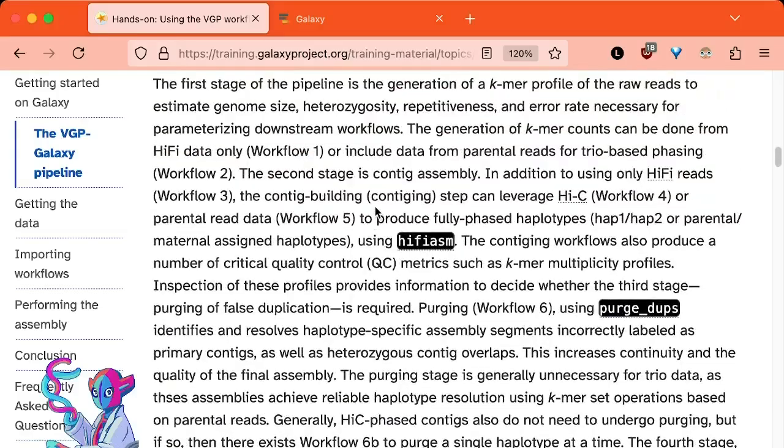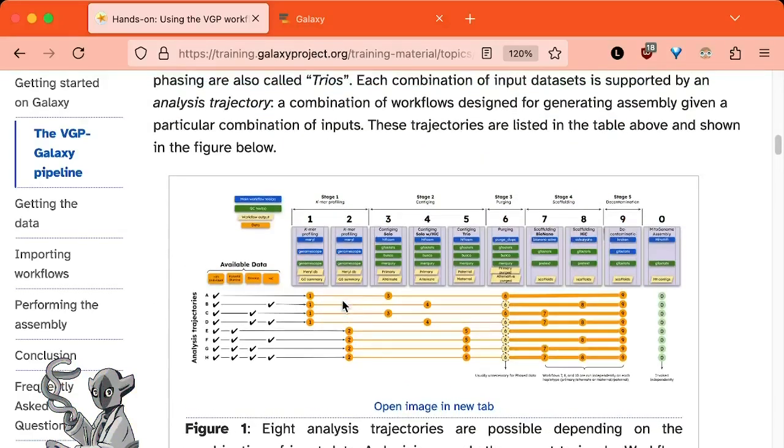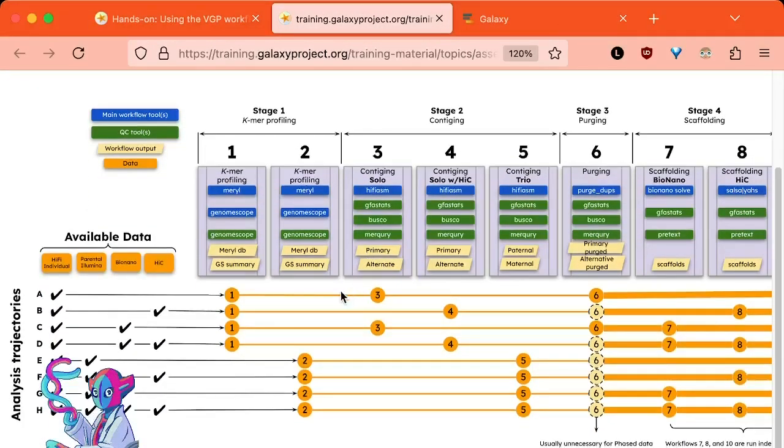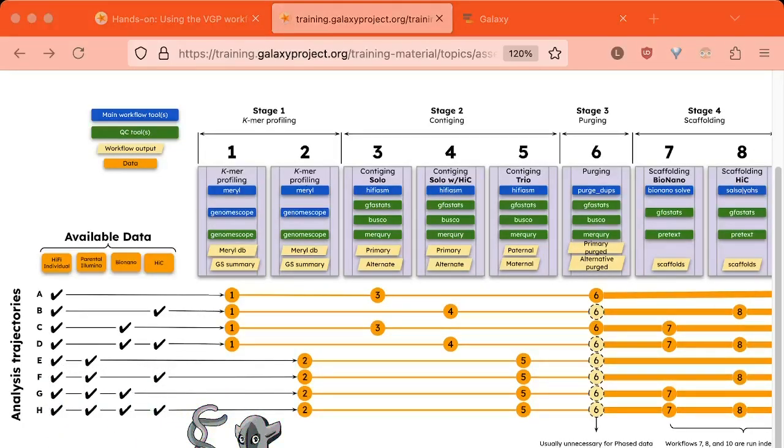You can pick and choose which workflows best suit the data you have. Trajectory B is used when you have HiFi data and Hi-C data for your individual. This trajectory consists of workflow 1, workflow 4, potentially workflow 6 (which is optional), and then workflow 8.